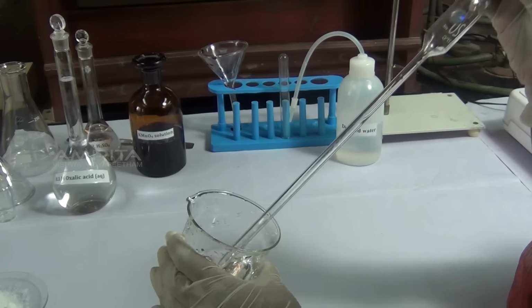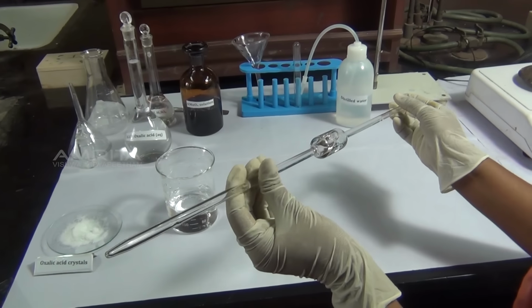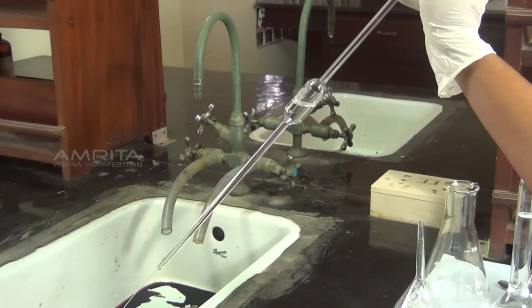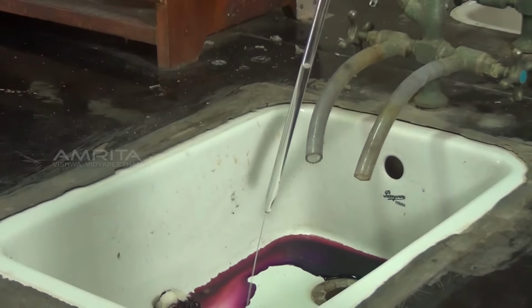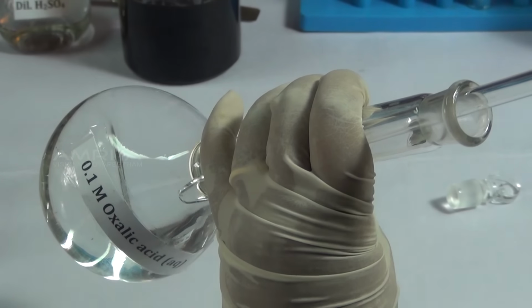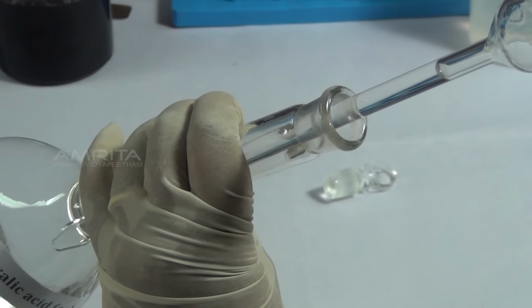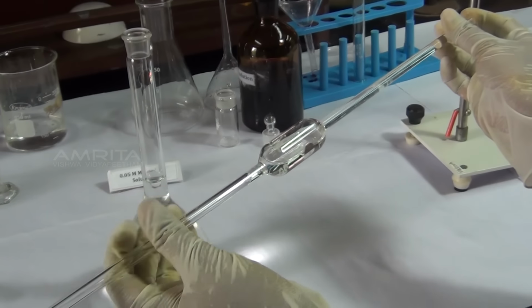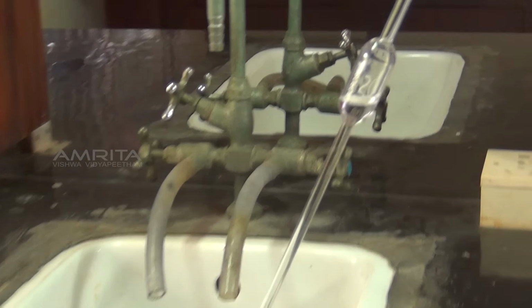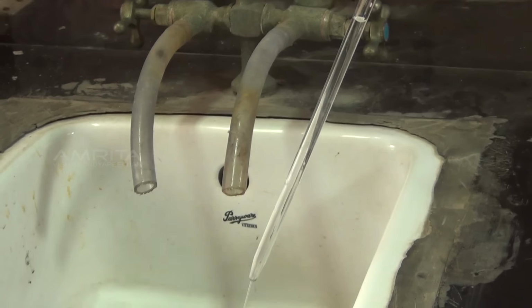Take the 20 ml pipette, pipette out a small volume of distilled water, rinse it and drain the water. Repeat this process 2 or 3 times to remove the impurities from the pipette. After rinsing with water, pipette out a small volume of oxalic acid solution, rinse the pipette and drain it. Repeat this step 2 or 3 times to remove any moisture inside the pipette.